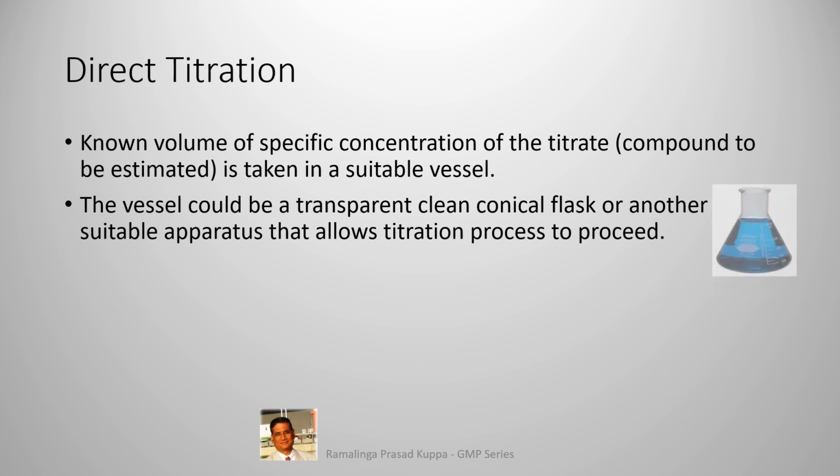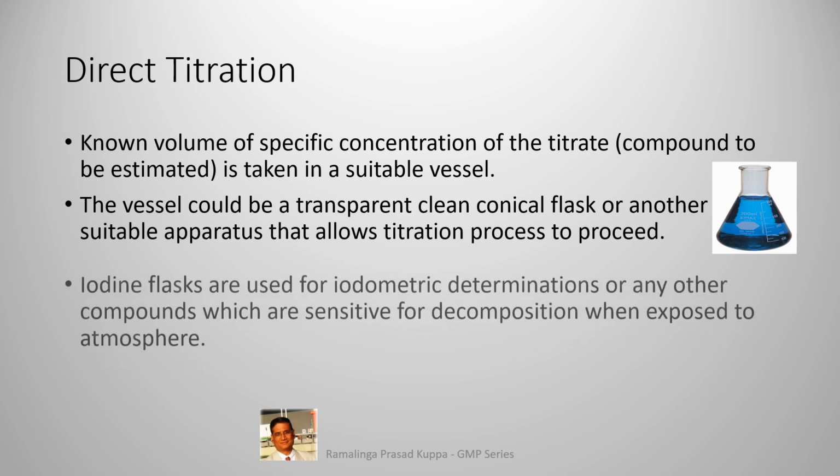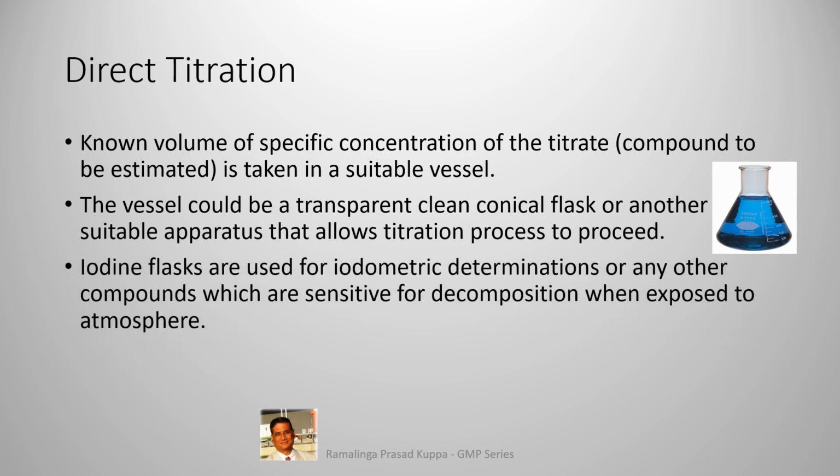This is a typical conical flask. Iodine flasks are used for iodometric determinations or any other compounds which are sensitive to decomposition when exposed to atmosphere.